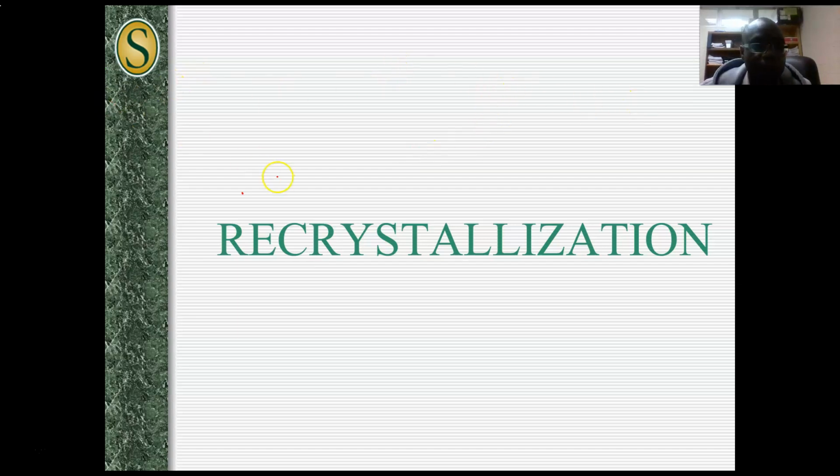So this is experiment 1 lecture. Recrystallization. This is a way of purifying. You use it to purify organic products.